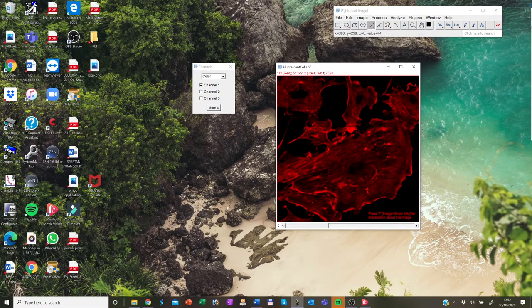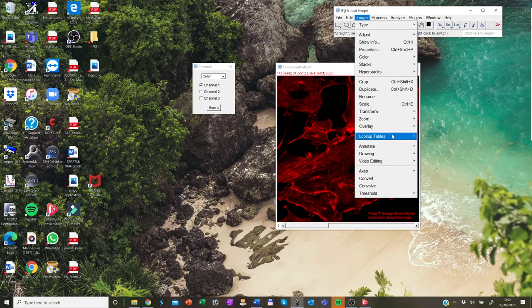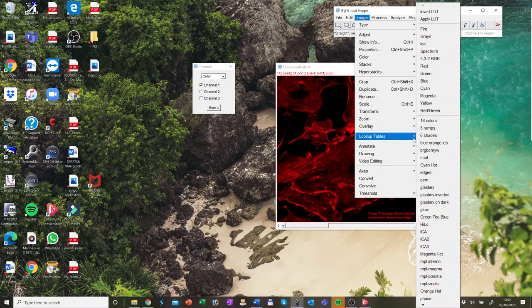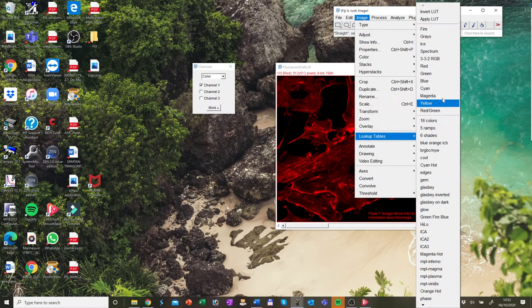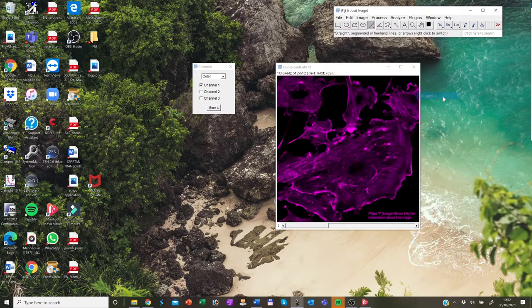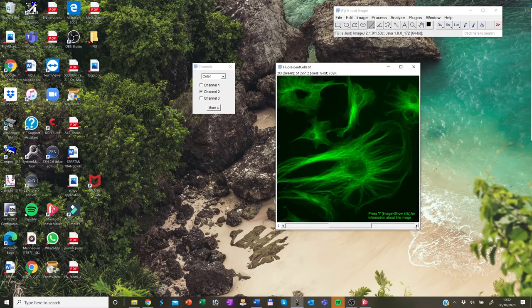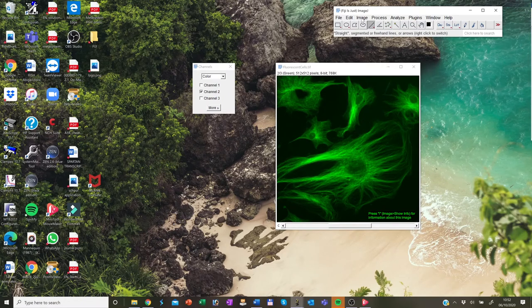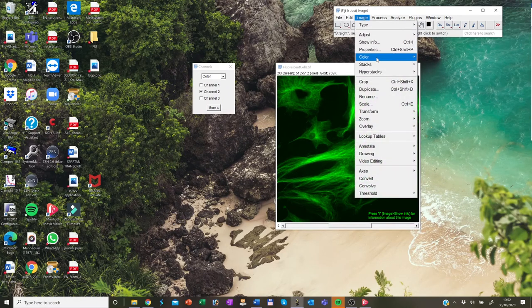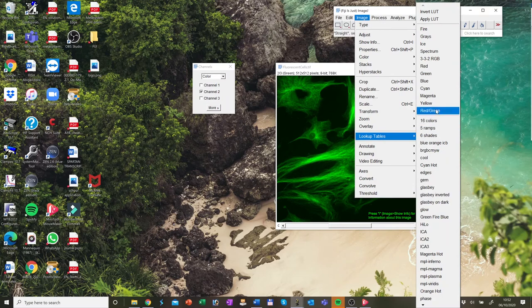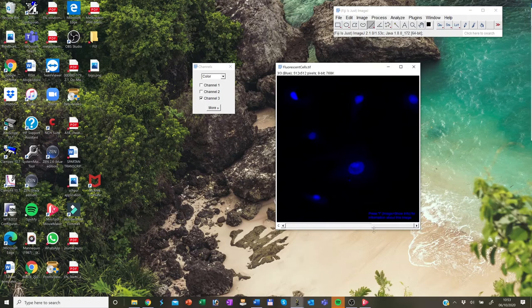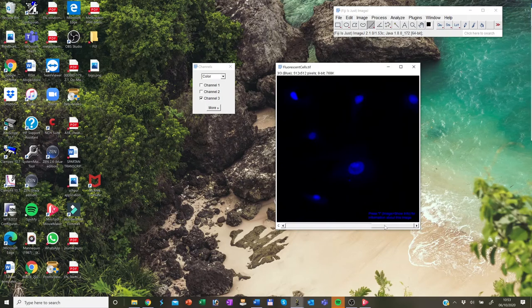First of all, you select the channel that you would like to change and then you go on image, lookup tables and for instance, in here on this channel, I would like to change it into magenta. And the next, which was originally green, I can change it into whichever I would like to choose, for example, fire. And then I leave the DAPI as it is.